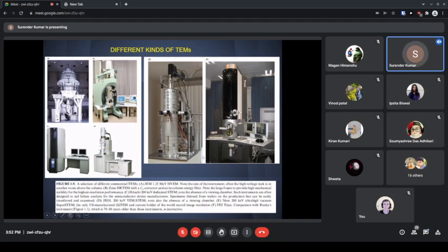So these are different microscopes. At the top you have the electron gun, as you see here in E, which produces electrons. Then you have an arrangement to accelerate these electrons towards the sample. Then you have the objective lens, which is basically an electromagnetic lens. And this is the whole arrangement basically. You need one full big room to put this electron microscope there.